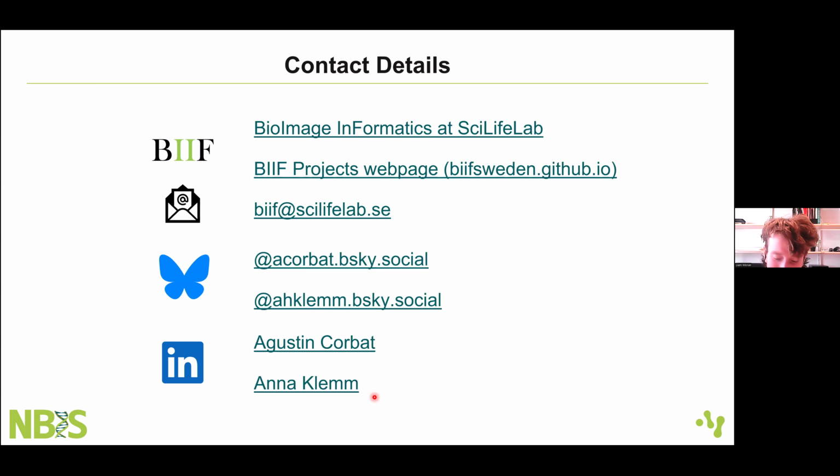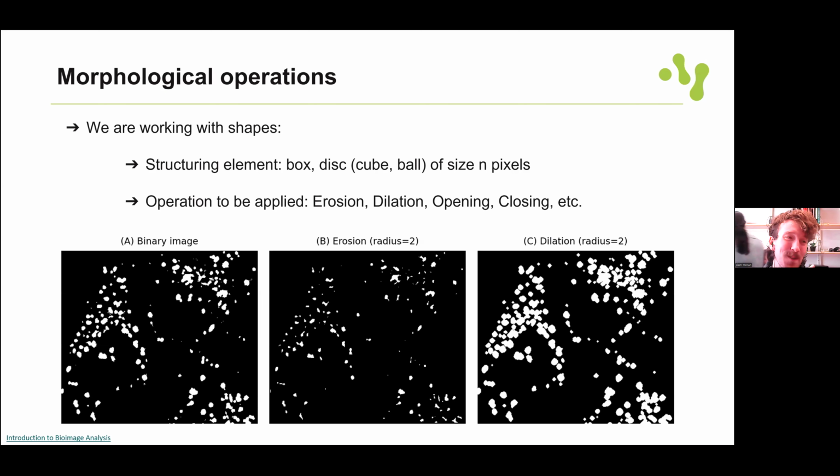When it comes to post-processing, like the masks or where you would fill in the holes with erosion and dilation, I'm thinking, you know when you go to a natural history museum and you see the dinosaurs, they have the bones or fossils that they filled in, colored differently to the ones that they found. In the same sense, is it worth showing these steps where you filled in parts that weren't there beforehand? Because I rarely see anything like that, and I think it would change because it's up to interpretation, I guess, when you fill in stuff versus when you don't. How much of these steps should you show?